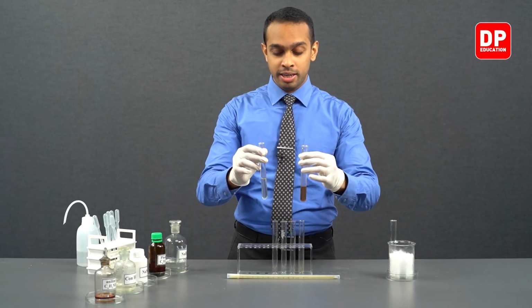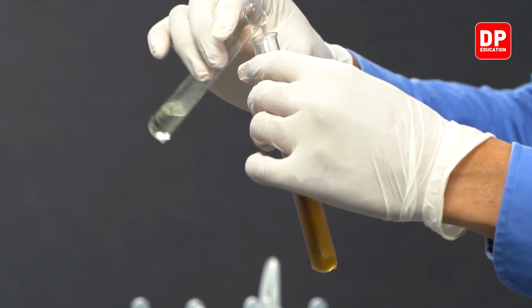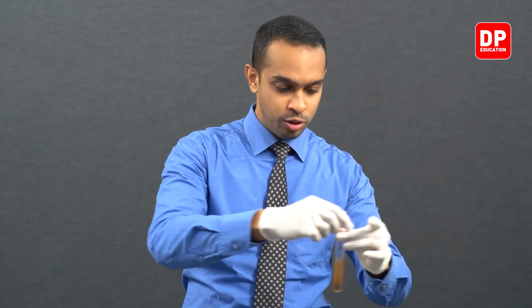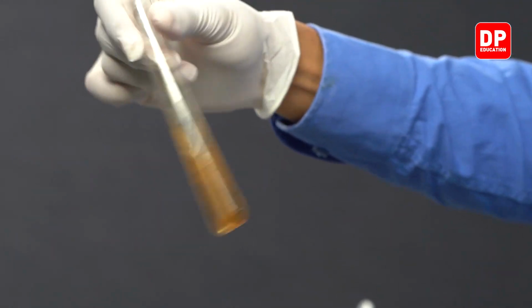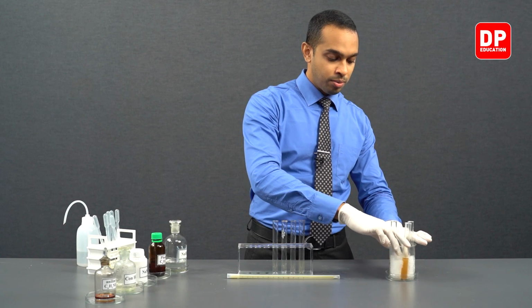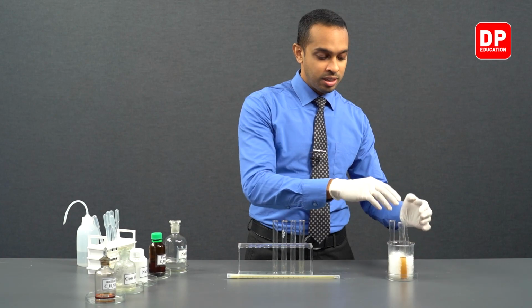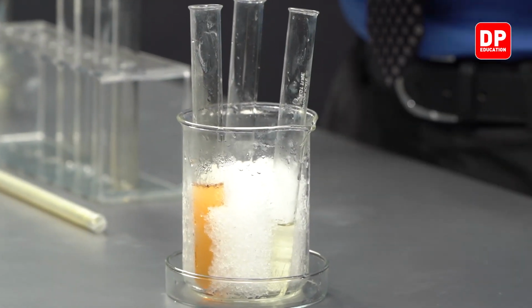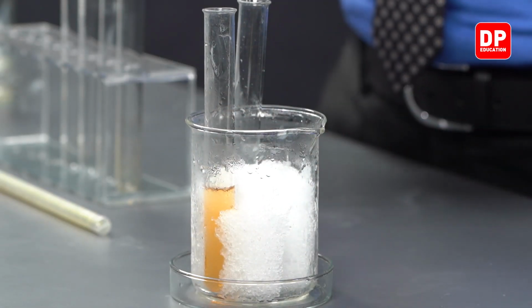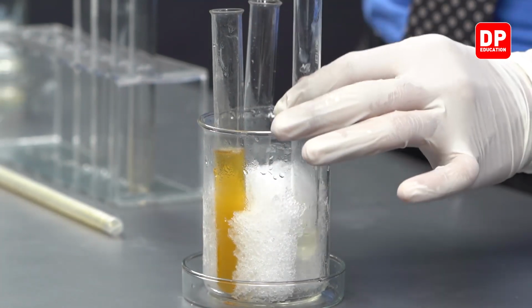aniline mixed with hydrochloric acid and let's mix them together. We have to keep stirring them while you mix it. And we have to make sure that we keep the temperature between 0 and 5 degrees Celsius as well. So we have to make sure that these test tubes remain in the ice bath for the most part of this experiment. So while keeping it in the ice bath, we can add our sodium nitrite.